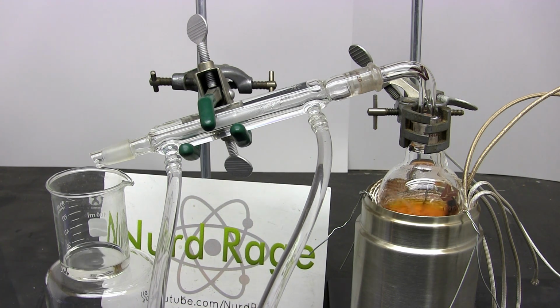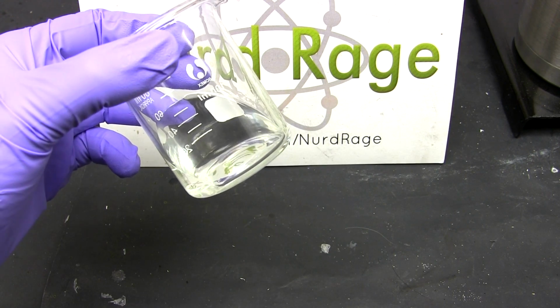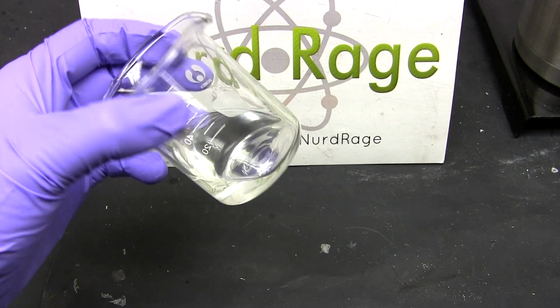I don't recommend going further as the distillation tends to bump and boil uncontrollably when it gets this low, spitting dirty acid over the condenser and into your clean acid. Before it gets that far, turn off the power and let everything cool. And there we have it, purified 98% sulfuric acid.